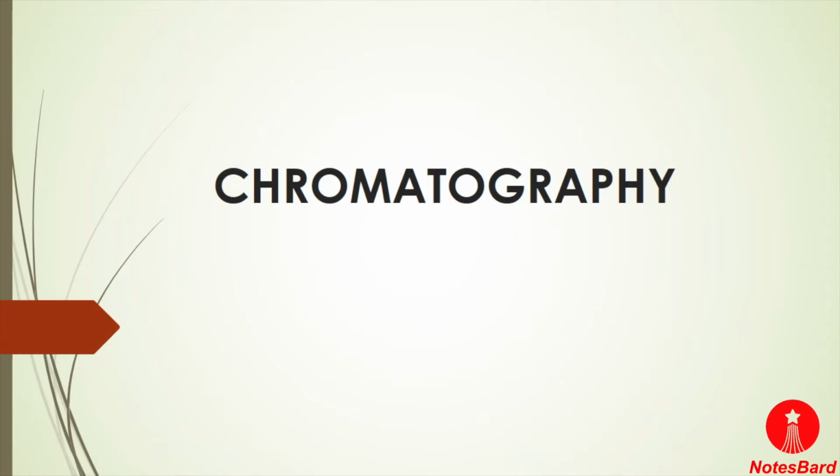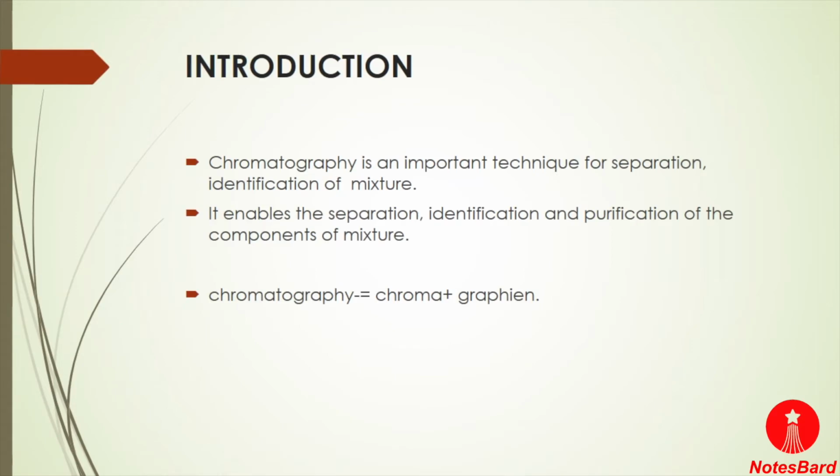So in this video lecture we will discuss chromatography. Now let's start with the introductory part. Chromatography is defined as an important technique used for the separation and identification of a mixture. Basically, it is a laboratory technique used for the separation, identification, and also purification of different types of components present in a mixture.